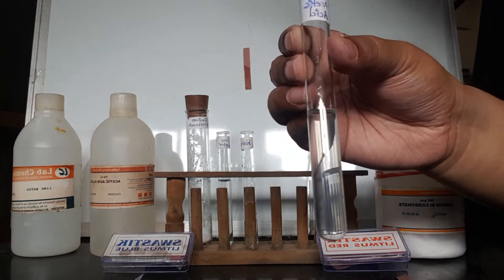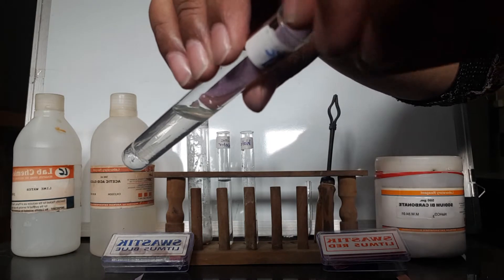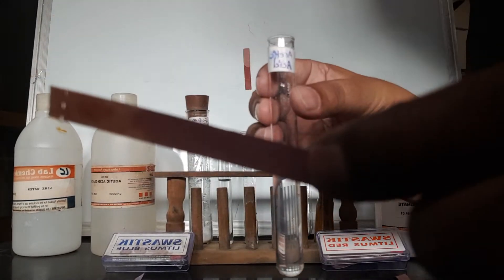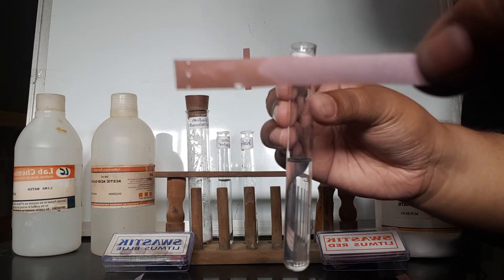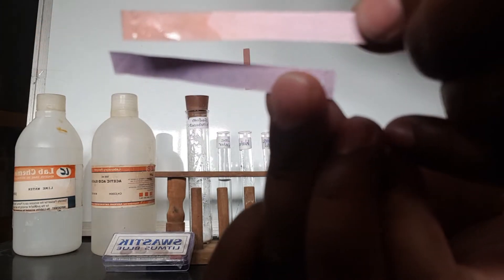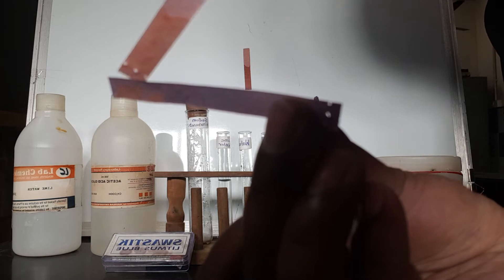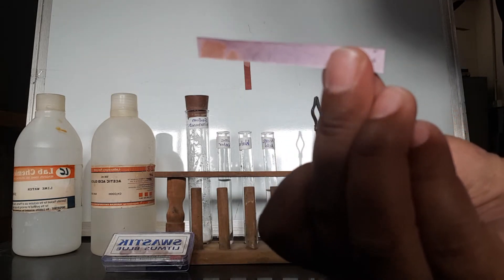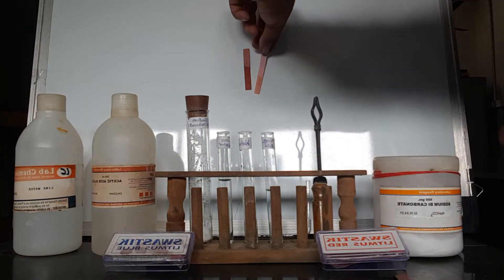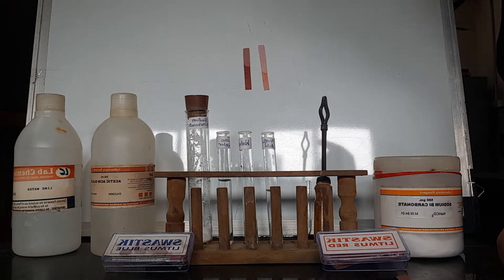Now we test with blue litmus paper. We dip the blue litmus paper in acetic acid. You can see that the blue litmus paper turns red. If I touch the blue litmus paper where the acetic acid is, the blue litmus paper turns red. This means acetic acid is acidic in nature.